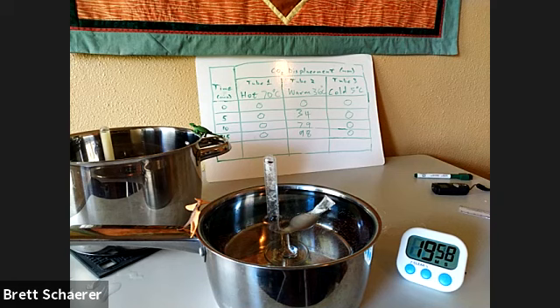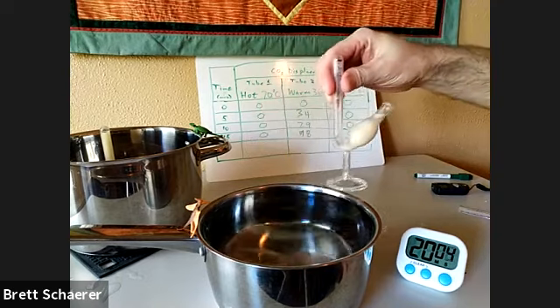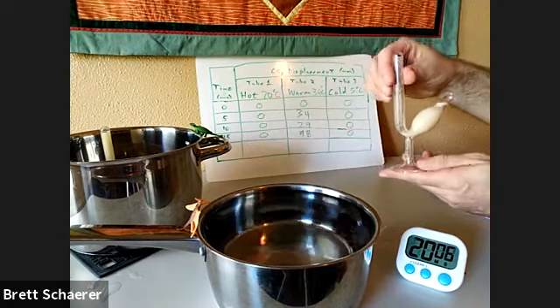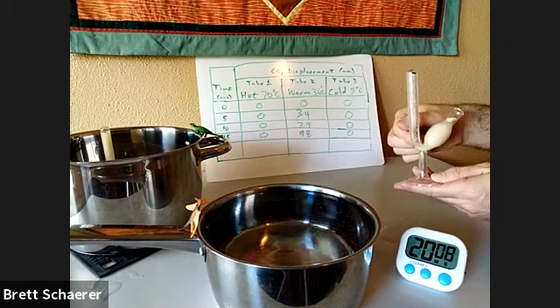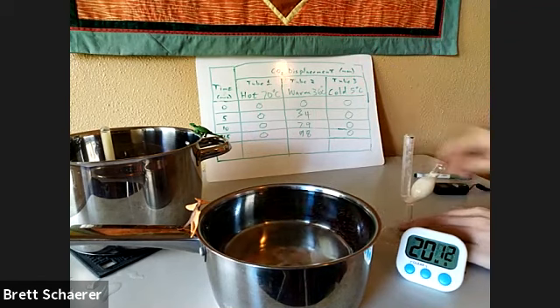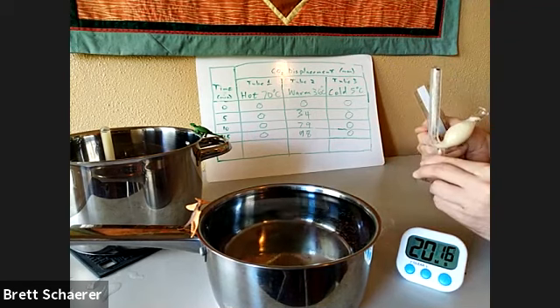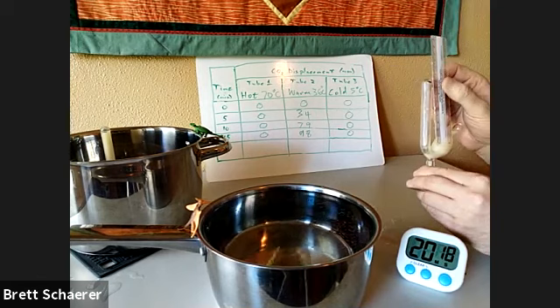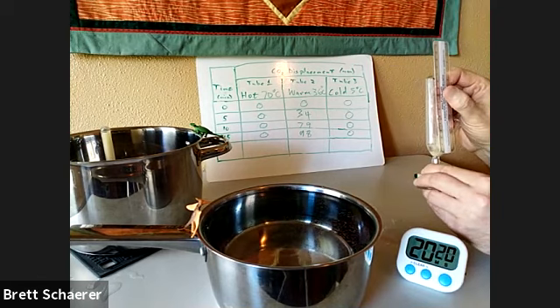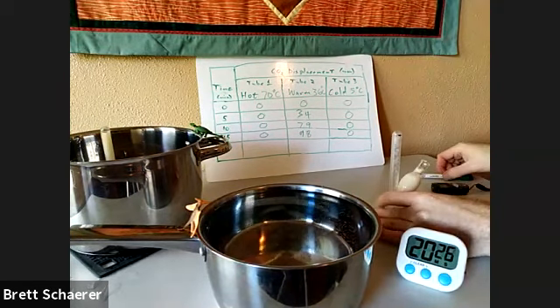Okay, we are coming up on 20 minutes. So again, we'll start with tube 2, the warm one. And as we can see, the mixture got pushed all the way to the bottom. I can take another measurement. Again, it's going to lose accuracy because it's kind of going around that curve. I'm going to call that 102 millimeters.